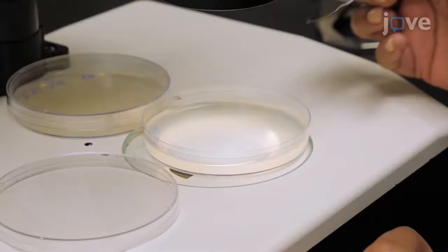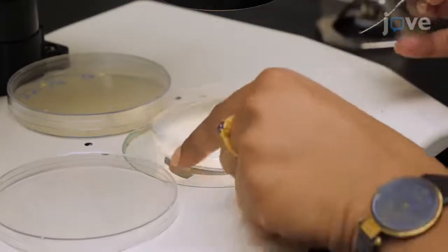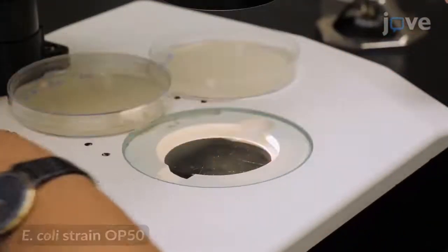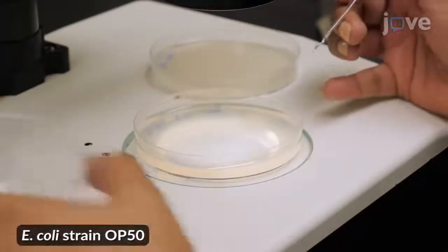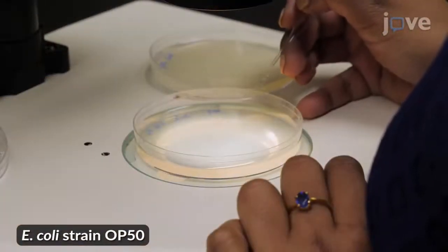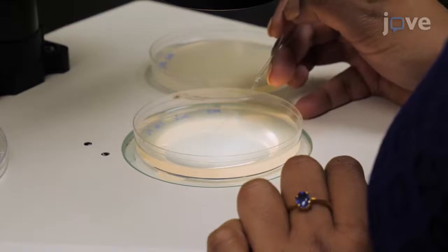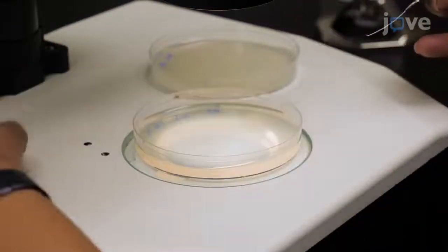To begin, transfer L4 larvae of desired genetic backgrounds onto a freshly seeded lawn of Escherichia coli on nematode growth media or NGM plates. Use at least two 100 millimeter or three 60 millimeter plates for each strain.